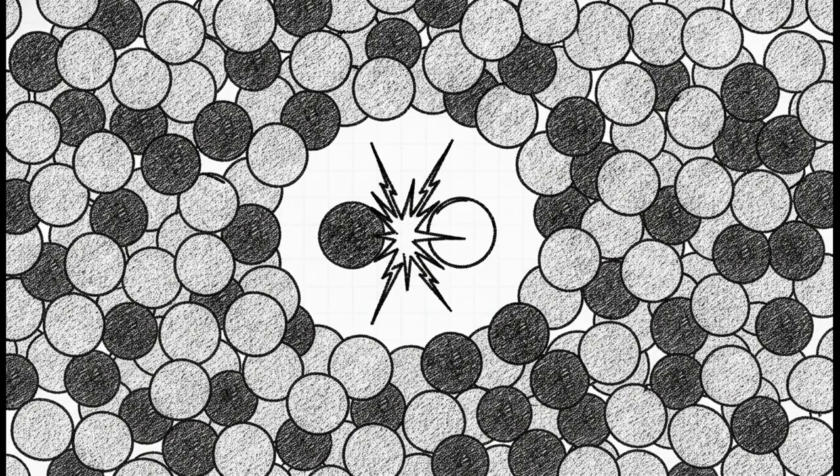If we aren't careful, this can totally complicate our data with abnormally large M+H peaks. It's just a great reminder that when our invisible obstacle course gets a little too crowded, it can literally change the runners in the race.